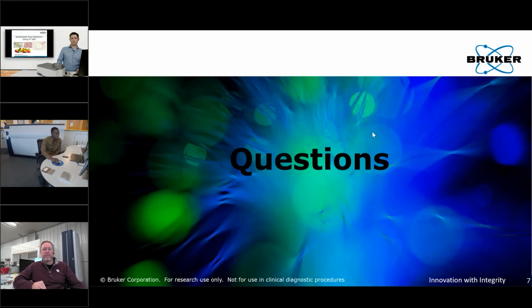Perfect. Thank you, Chris. Let me see, what else do we have? For Dr. Krueger as well: is it possible to identify the flavonoids and oxidations? I'm not sure if that's actually a clear enough question.